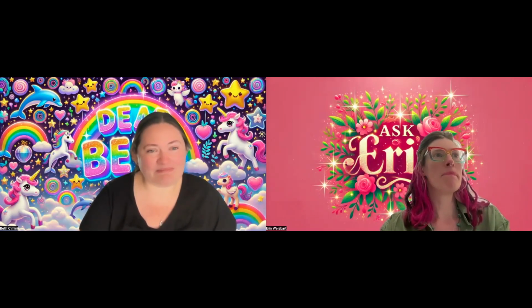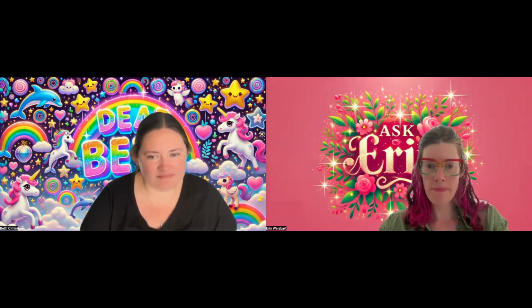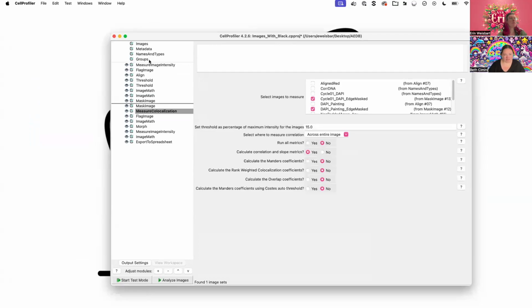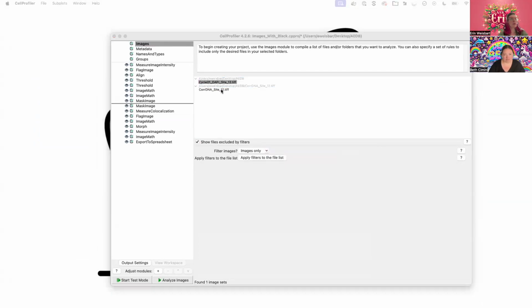Awesome. Okay. Well, let's get started with this. So, I am going to show you what we're working with. All right. So this is my pipeline, and here I will show you my two input images.